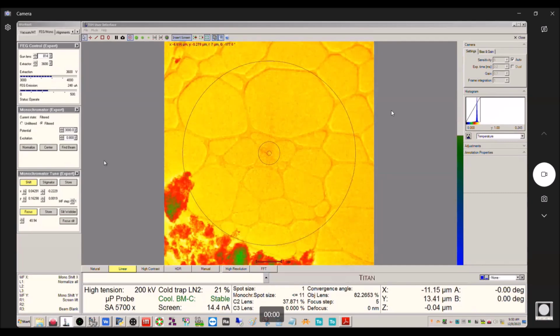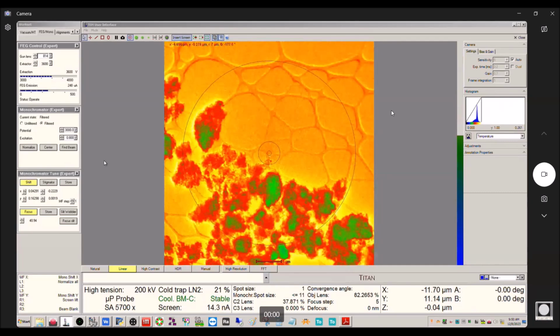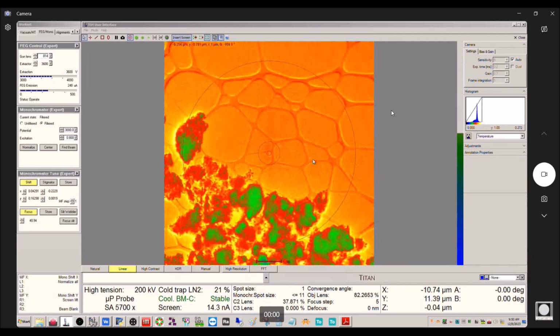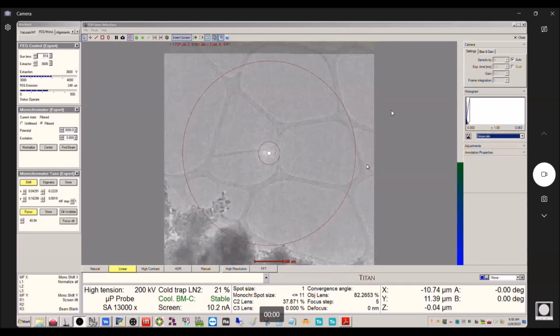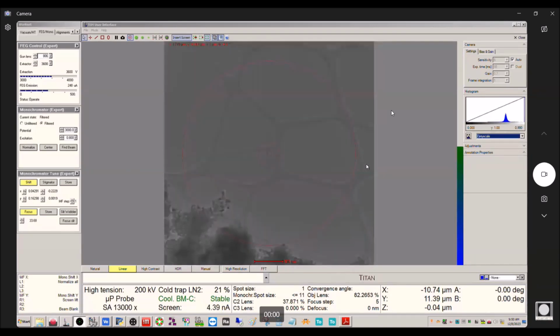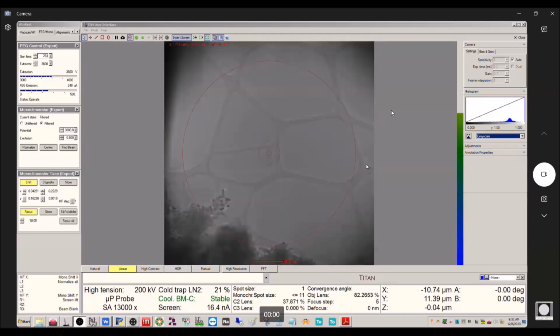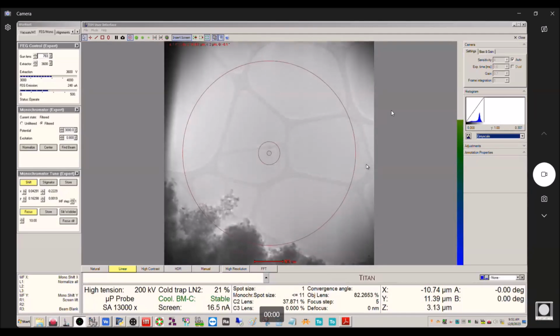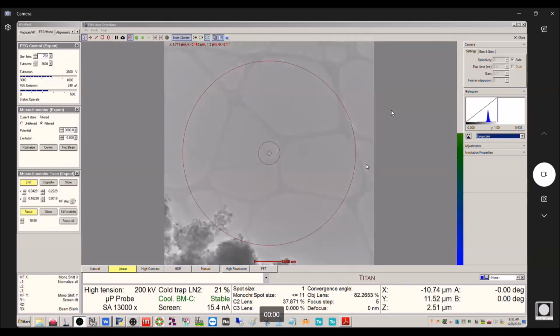Yeah, we're over here, so we're not too far away. Right about there. All right, I'm going to leave this spread out for now.